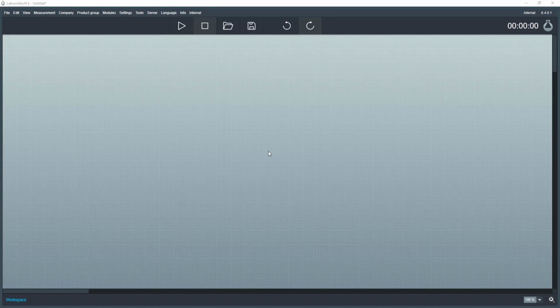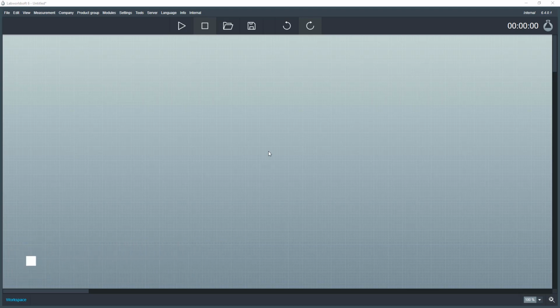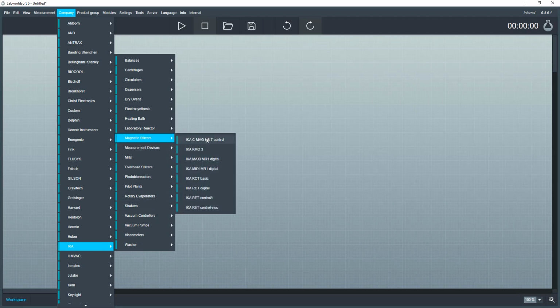In this video, I show you how to remotely control and monitor a laboratory device with the help of Labworldsoft 6. The first step is to select a laboratory device that you want to remote control from the device library. There are different ways to do that. You can find the desired device, for example, in the menu using the company name and the product group. In my case, I want to control a magnetic stirrer.